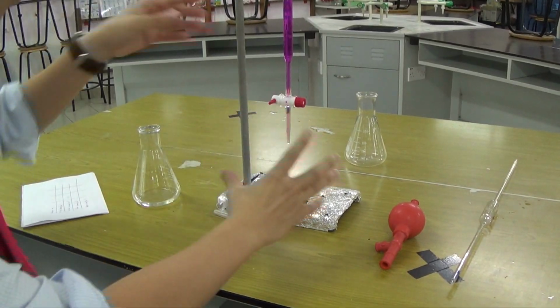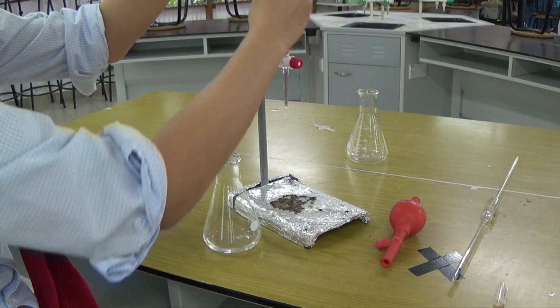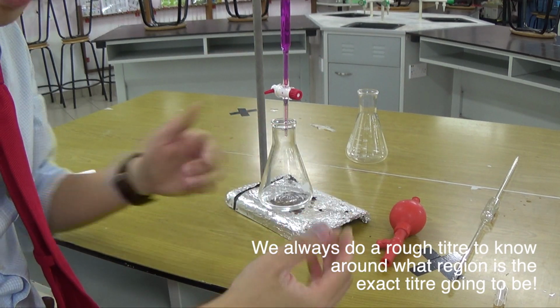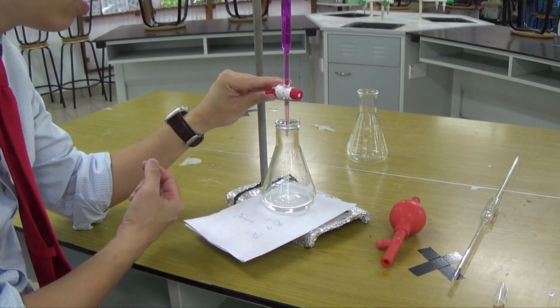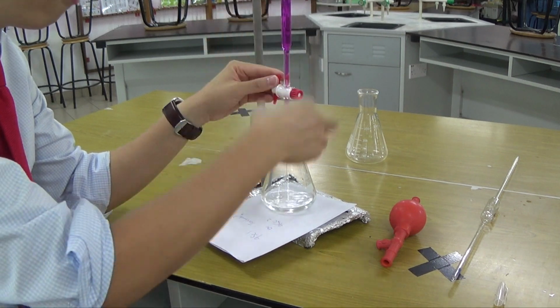So we're going to do a rough titration here. Rough titration means we don't care so much what the actual reading is, because if you don't know roughly where it ends, then you're not going to be able to work out the exact titre. By right, you should have a white tile at the bottom, and that should help you to see the color change better. So as I already recorded the initial volume, I'm ready to just open the tap fully.